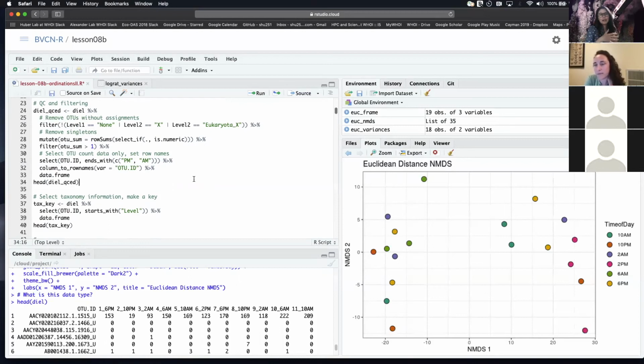And then I'll go back, and the decontam package with phyloseq actually does a similar thing in terms of looking at library sizes. And then you can start to compare things like library size of your blanks, same with samples. So maybe it's a little more manual, but if I see an outlier start popping up, then I'll go back to the beginning and try to diagnose what happened. Mm-hmm. Yeah, that's the nice part about working in R.